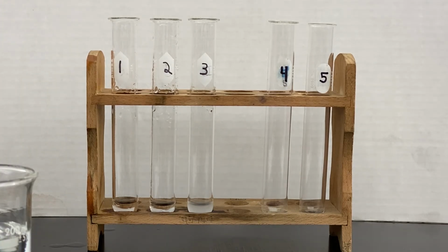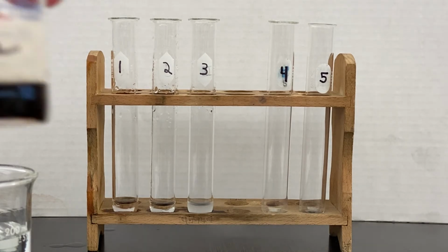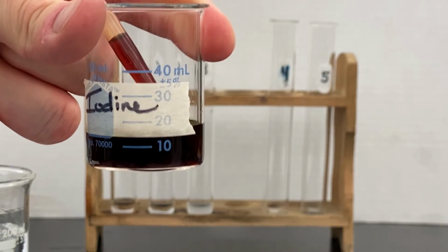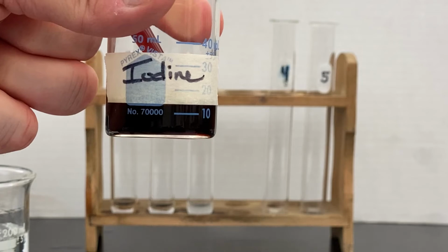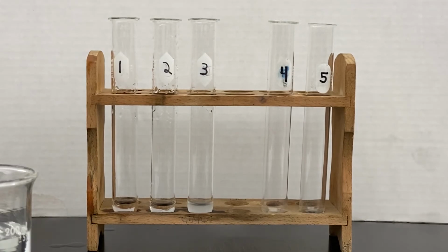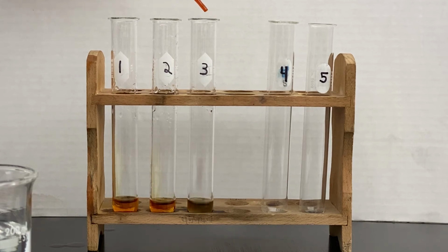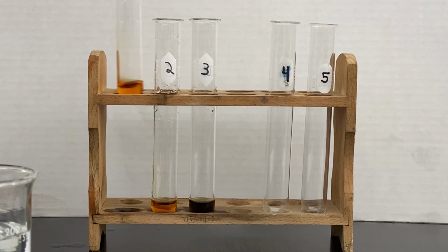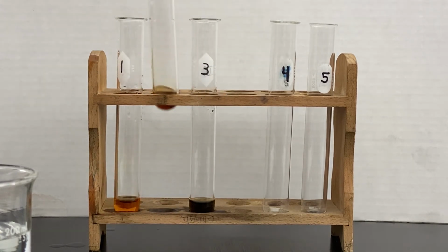Okay, we're going to use a different chemical indicator. This is called iodine. It's a brownish, tannish, amberish type of color. You can see it in the dropper there. Kind of looks like soda. So I'm going to put 4 drops in each of the 3 test tubes. And we're going to swirl each of them. We don't need any heat this time.